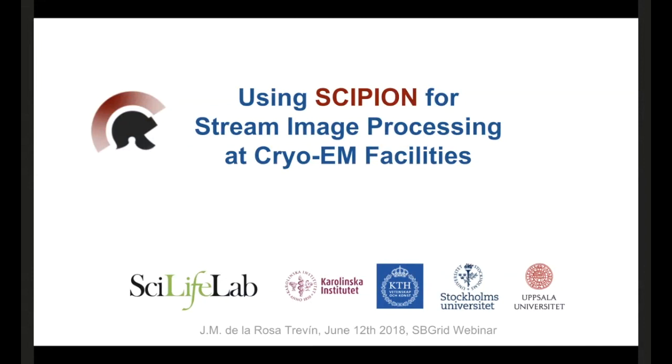Today is my pleasure to introduce Jose Miguel de la Rosa Trevin, who is joining us from Sweden. Jose is the developer of Scipion. If you're not familiar with Scipion, it is a Cryo-EM processing package that takes advantage of its own built-in tools, but also the capabilities of a number of other software packages including Relion, Frealign, EMAN2, and many more, to give you the options on how to process your data using all of these tools within workflows that are documented and built within a graphical interface.